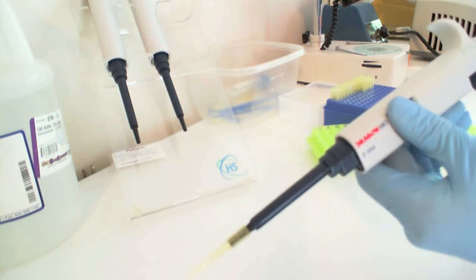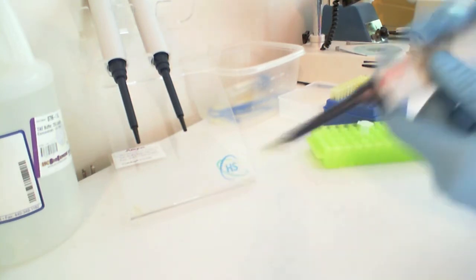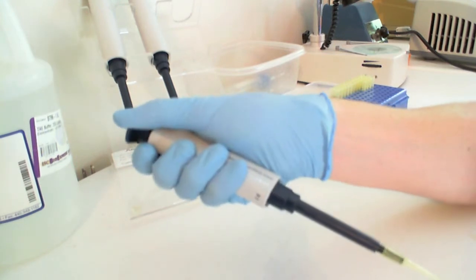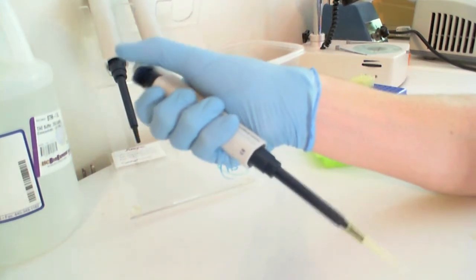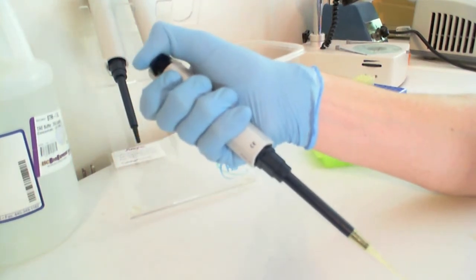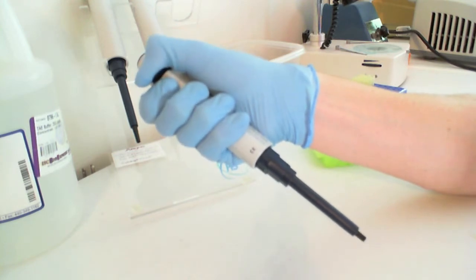So when you're done using one reagent, you're ready to change tips. Simply position your pipette over your waste receptacle and press on the end of the pipette, which ejects the tip.